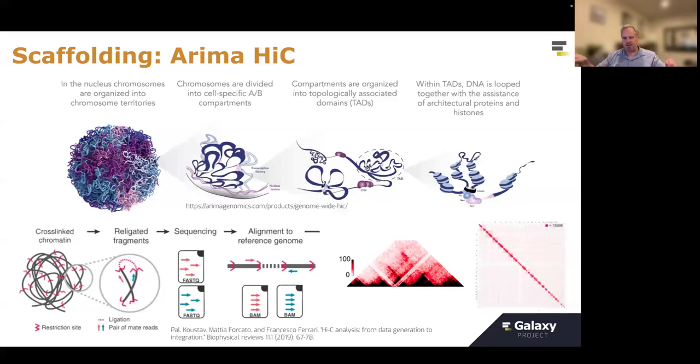We do this for many millions and millions of pairs of reads. You can think of those as mate pairs, where the pair of reads come from individual molecules, just that the distance between them is variable. Sometimes they'll be right next to each other. Sometimes they'll be thousands of bases apart, or hundreds of thousands of base pairs apart. Occasionally they'll be millions of base pairs apart. Occasionally there will be a transient interaction between one chromosome and a completely different chromosome. But those interactions tend to be substantially fewer than interactions that are nearby on the same chromosome, nearby in cis on the same molecule.